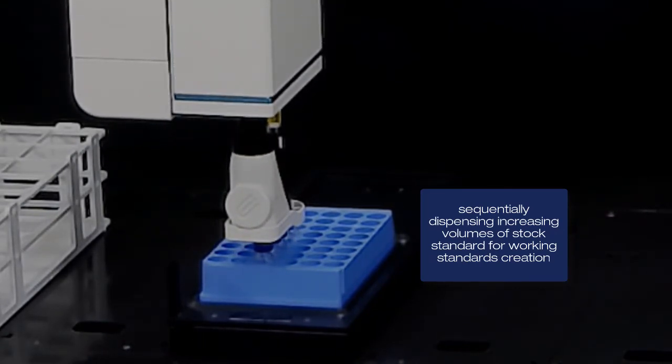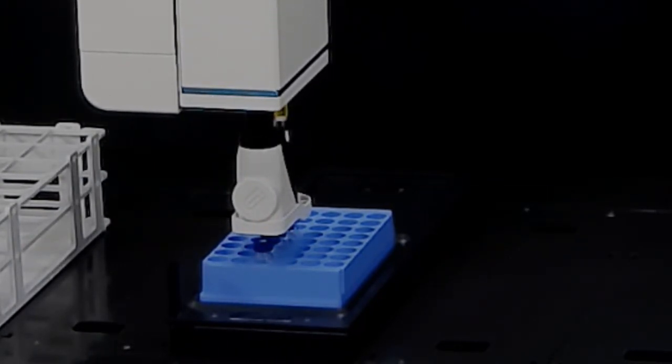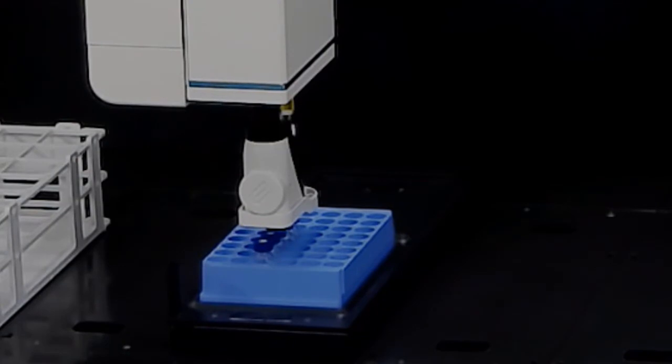Watching the ePrep in operation now, you can see how the ePrep can easily automate what would otherwise be a very labour-intensive and boring task, and it will do it the same way every time. I'm watching this, but of course I don't need to be here. In fact, this could be running in the middle of the night and the standard's ready for me when I arrive for work the next morning.